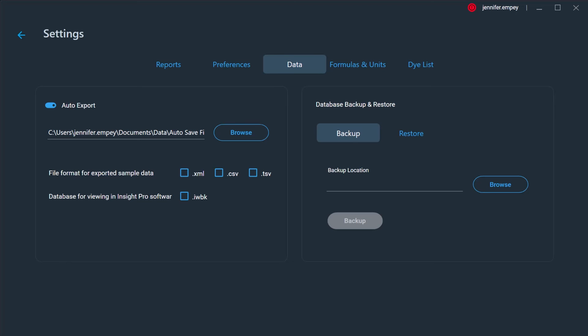The file types of the saved data include .xml, .tsv, .csv, and .iwbk. The latter file type is unique to the Insight Pro software.